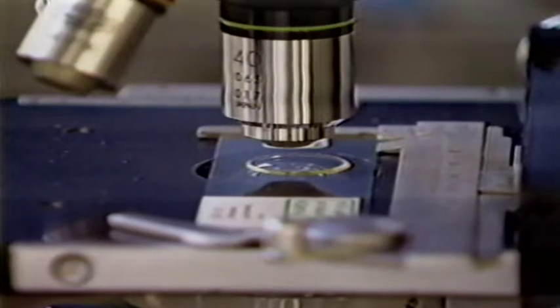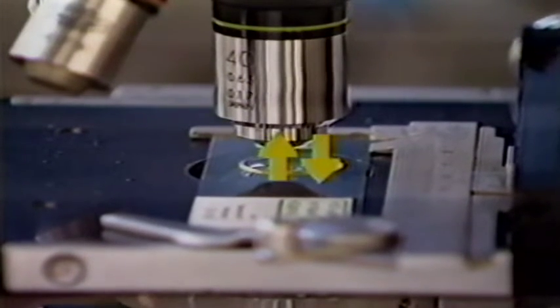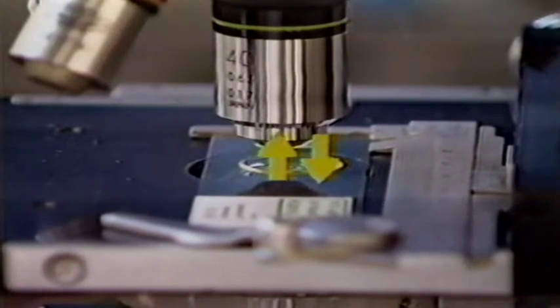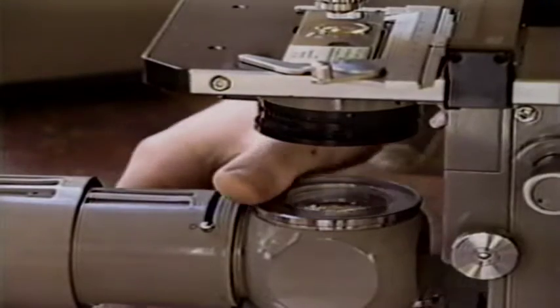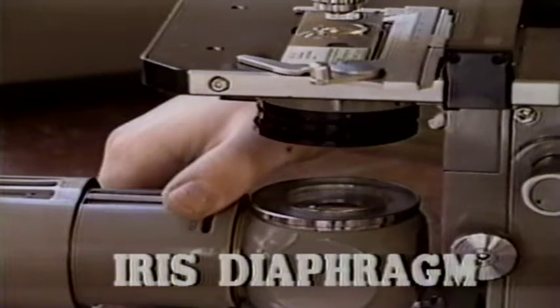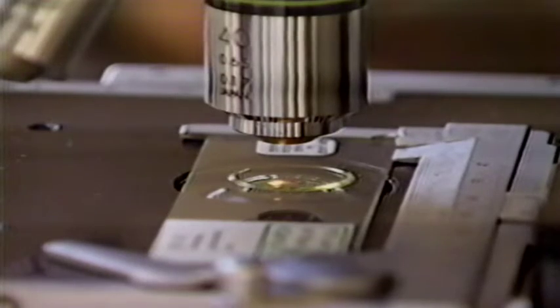As we have said, the flat area upon which the slides are placed is called the stage. The space between the objective lens and the slide is called the working distance. Beneath the stage, or mounted on the light source, is a disc or iris diaphragm which can be opened or closed depending on the amount of light required for optimum illumination of the specimen.